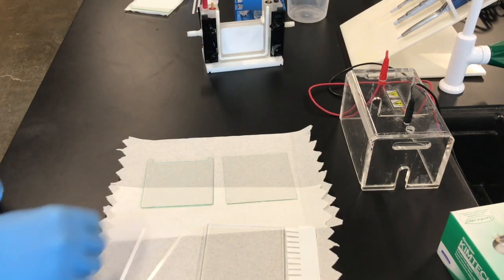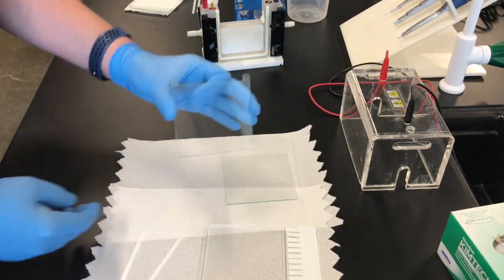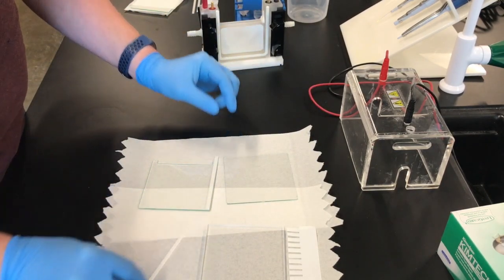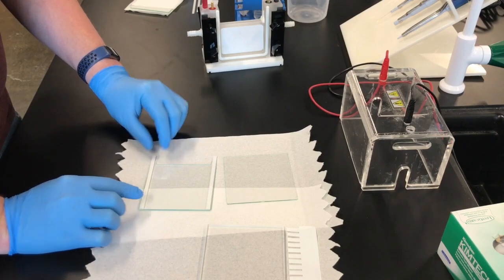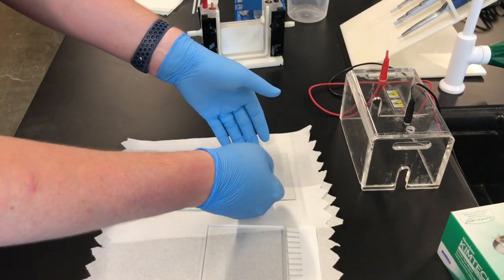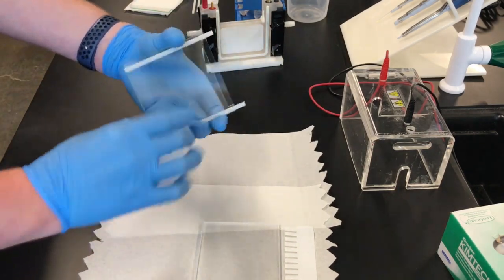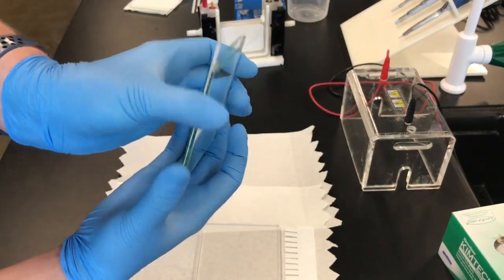Once the ethanol has dried, we'll take the plate with the notches on it and place the spacers to line up with the notches on both sides. Then take the square plate, flip it over, and place it on top so that we have a sandwich with the spacers in between the two glass plates.